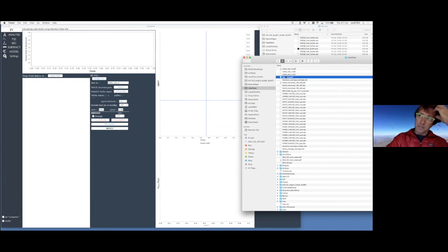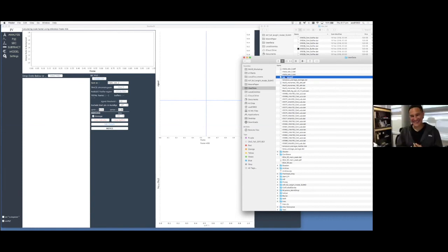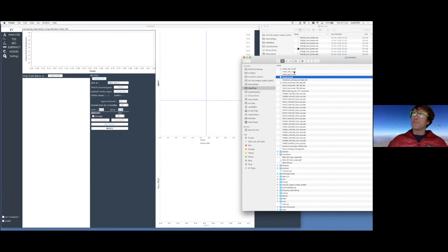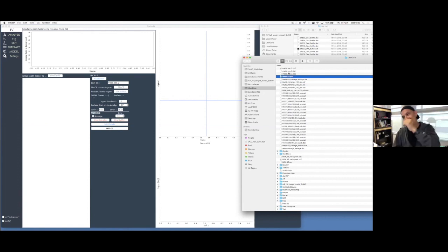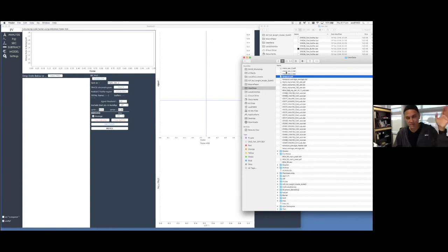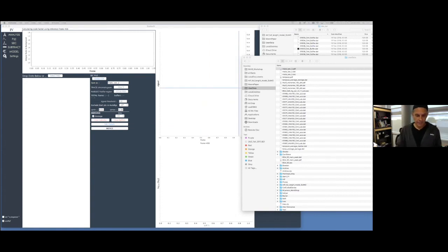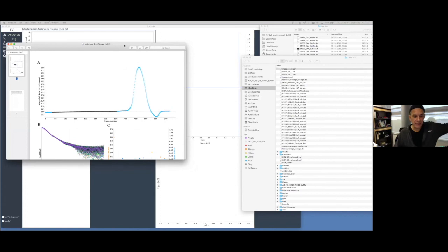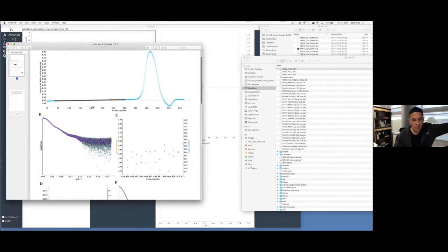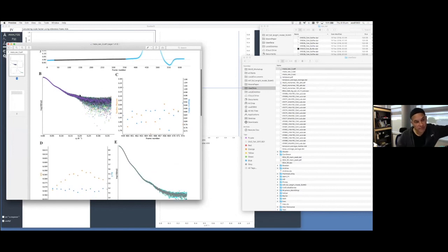There was a question about how the similarity map is calculated — it uses the Durbin-Watson statistic. If two things are exactly the same, the residuals should be random. What's neat about it is that if something is random, the Durbin-Watson number comes out to 2. If positively or negatively correlated it oscillates between 0 and 2 or 2 and 4. You square it and get a nice color map.